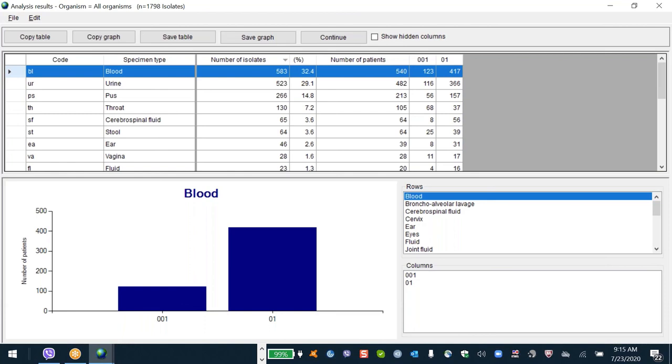Yeah, Gabriel is online. Does this answer some of the quality issues that you're expecting to review today? Yes, Fern. Especially the quality control cleaning and specimen cleaning, the one he talked about, and antibiotic resistance. Especially the alert is very important to inform clinicians at facility level, and in fact, also for our epidemiological report. So this is what we really need and achieved.